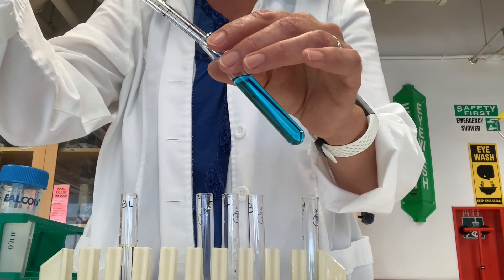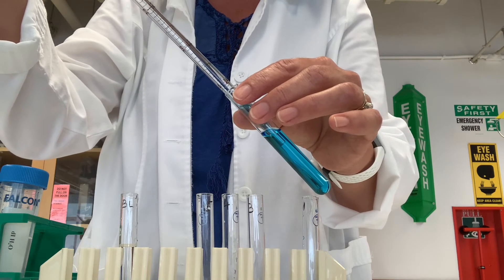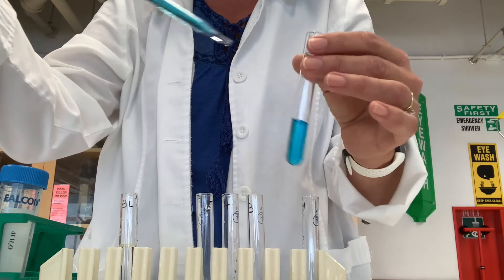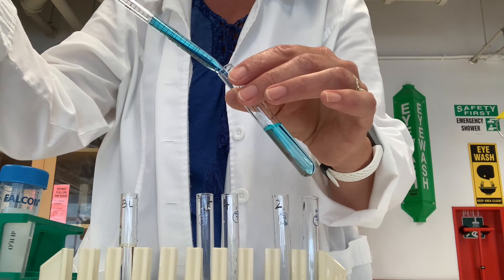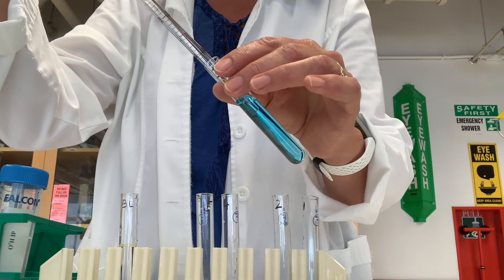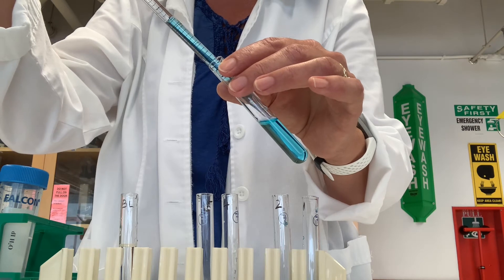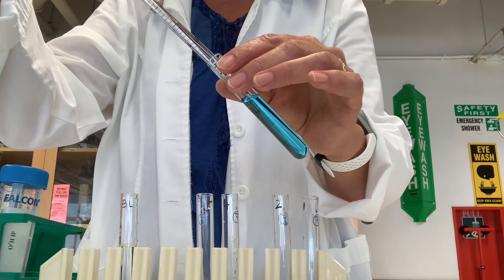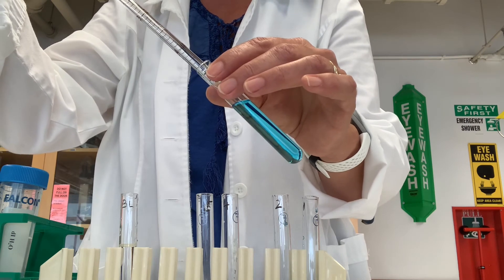Now we're ready to make the next serial dilution. I draw three milliliters out of tube two and transfer into tube three. To make sure it's all well mixed, I pipette it up and down two or three times. Notice that I am only keeping the very tip of the pipette submerged under the liquid as I pipette up and down.